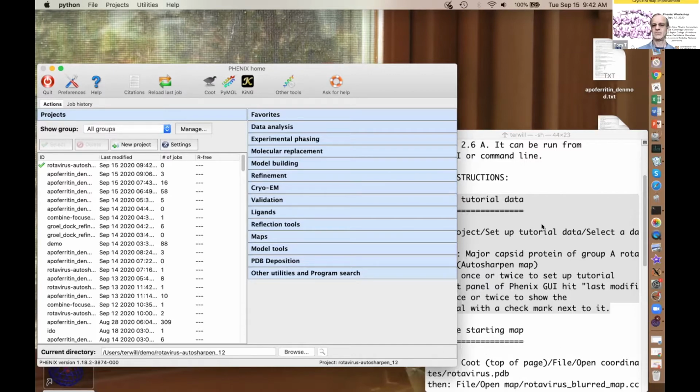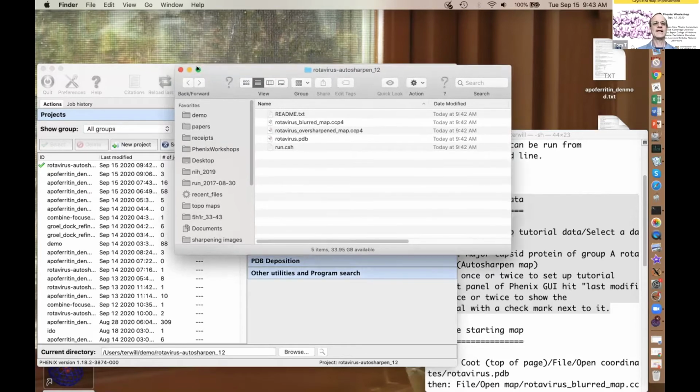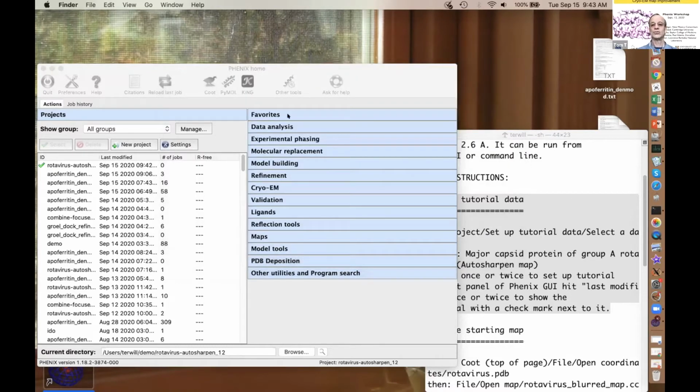my Zoom is covering that up. Okay, it opens up a browser window in that directory. So if you want to work with any files in that directory, they're right there. So we're going to close that. We don't need it now, but we actually will do that a little bit later. Okay, so now we have files that are ready for our tutorial.